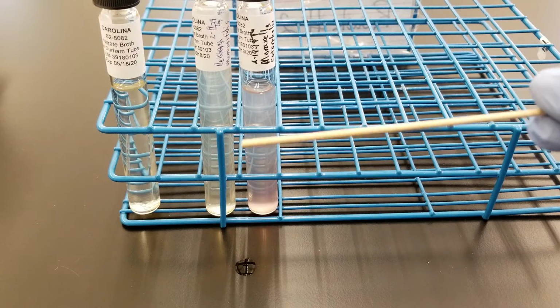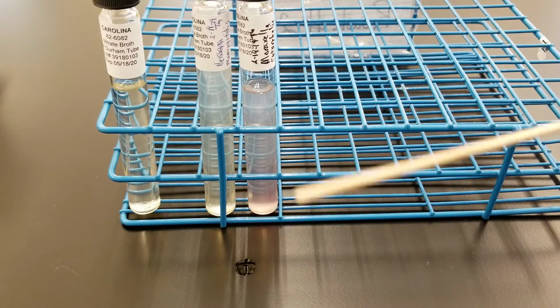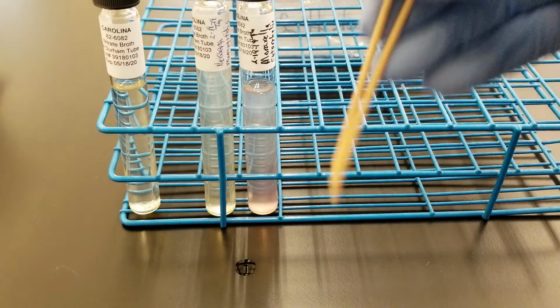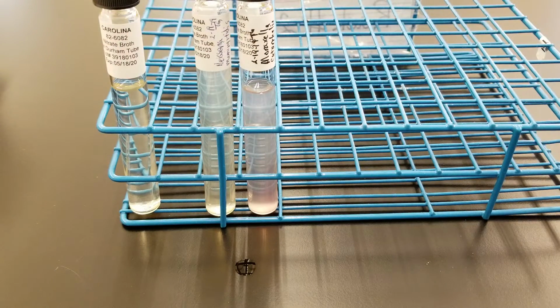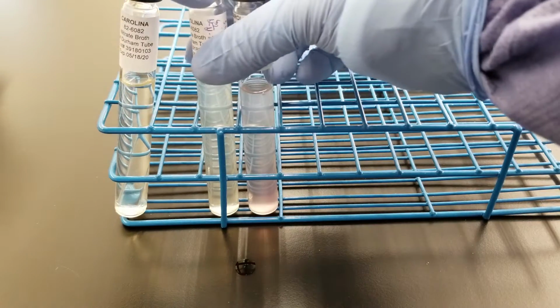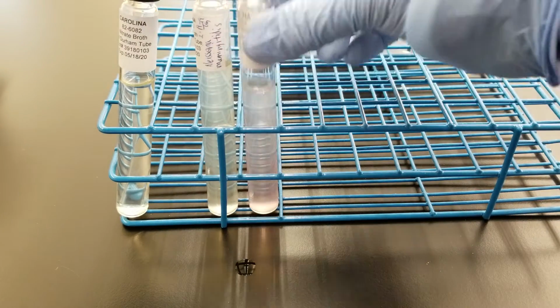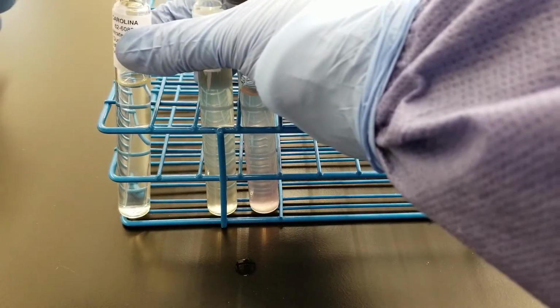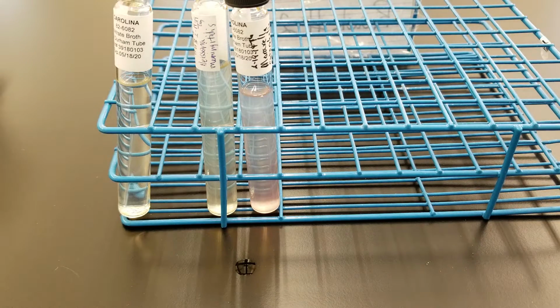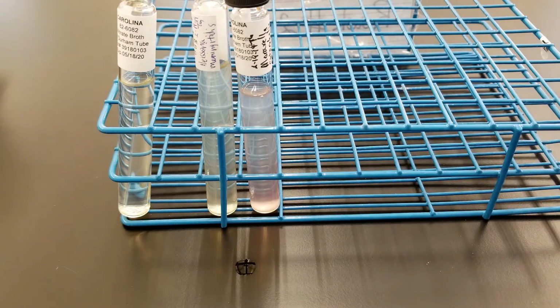This is the stick that you would use. It's a clot detection stick. You know, you put it in and you check for a clot in a whole blood tube. So I'm going to try to show you both types of processes. I'm going to uncap these really quickly. We don't need to uncap the Moraxella because we know that's already positive. So we're just going to do the 2 negatives. So I'll try to do the one with a stick and then one with the spatula.